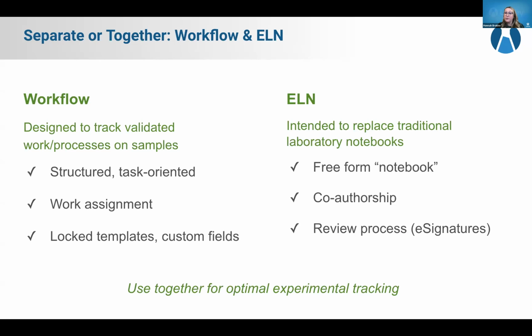As I mentioned, it's very structured and task oriented. So if you know exactly what those steps are and those aren't getting optimized or deviated from, workflow is a really great choice. We also have built in a work assignment piece. So if I want to assign work to Andrew or to Lance or to Tori, I would be able to do that, and they would get a notification and it would show up in their queue as work to be done within the system.